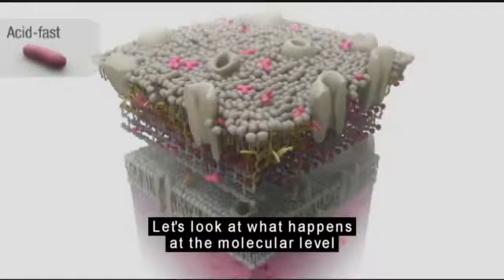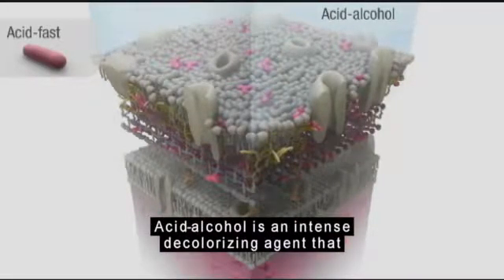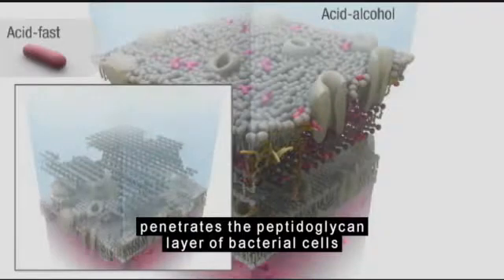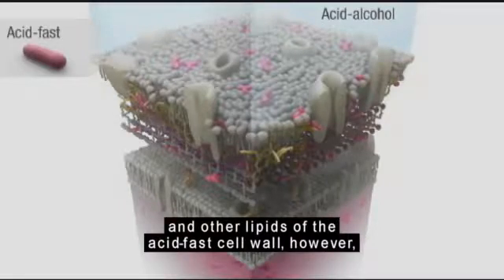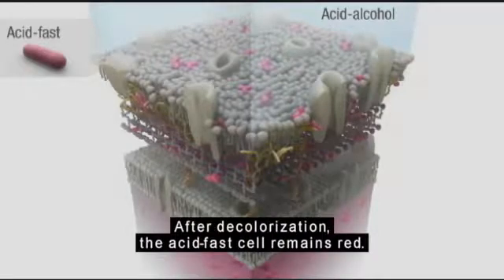Let's look at what happens at the molecular level when acid alcohol is added to the smear. Acid alcohol is an intense decolorizing agent that penetrates the peptidoglycan layer of bacterial cells and washes out stain from the cell cytoplasm. The mycolic acids and other lipids of the acid-fast cell wall, however, impede the entry of acid alcohol. After decolorization, the acid-fast cell remains red.